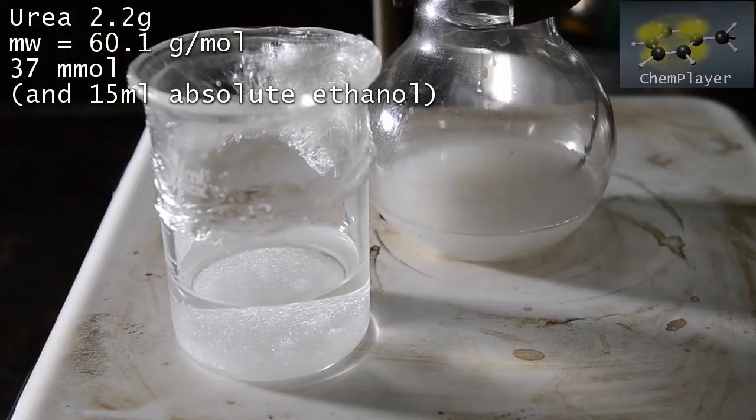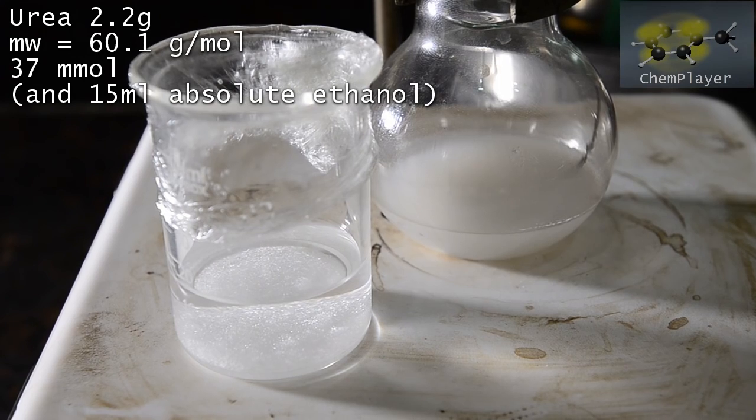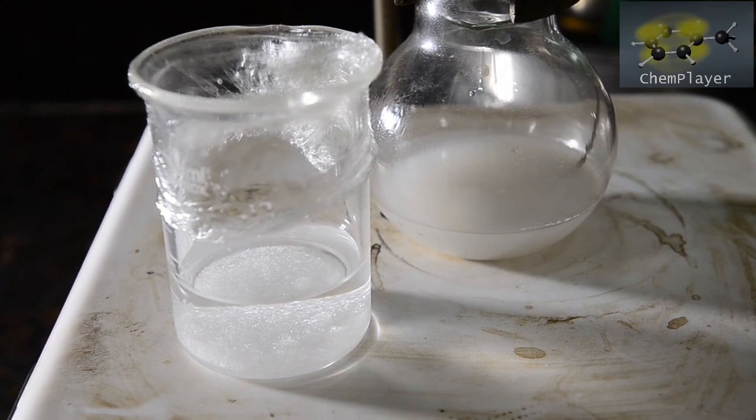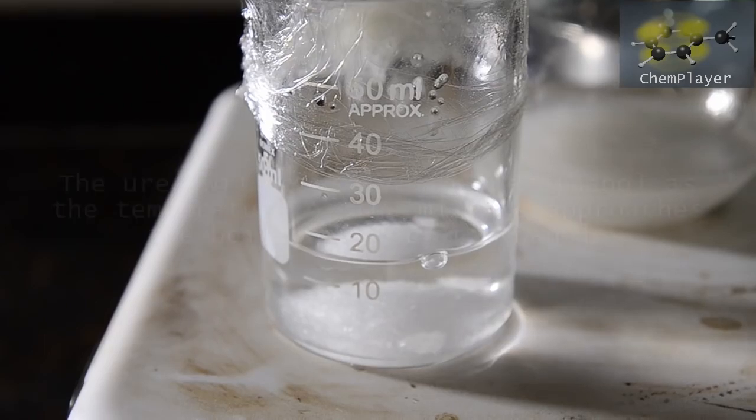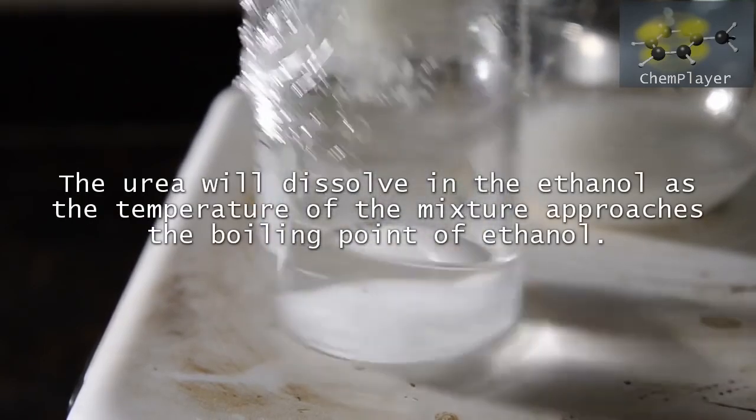We've got the hot plate switched on and we're now going to heat the urea and ethanol until the urea goes into solution. We've covered the top of the beaker to stop moisture getting in. The urea will dissolve, but it requires the ethanol to be nearly boiling.